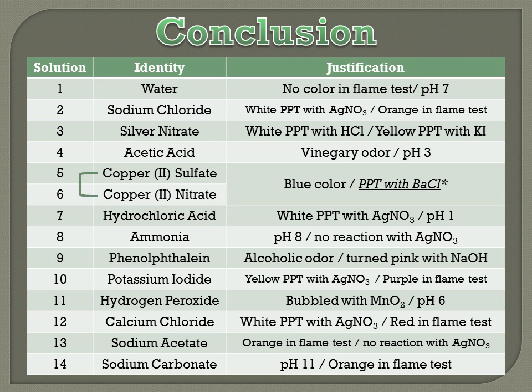Secondly, the reaction between silver nitrate and sodium chloride should have created the white precipitate silver chloride. However, no visible solid formed during the experiment. This may have occurred as a result of insufficient reactant molarities or human error in failing to notice a white solid in a white spot plate. This could have been resolved by repeating the trial on a sheet of clear plastic on the black table surface. And that is the Mystery Solutions Lab.